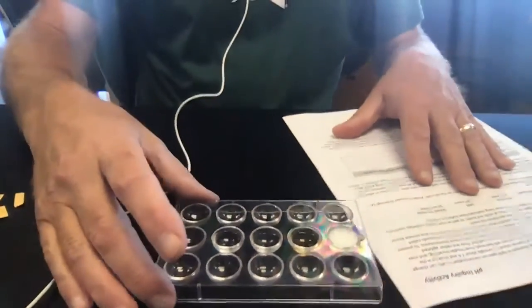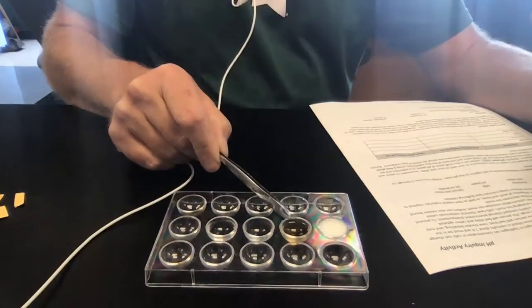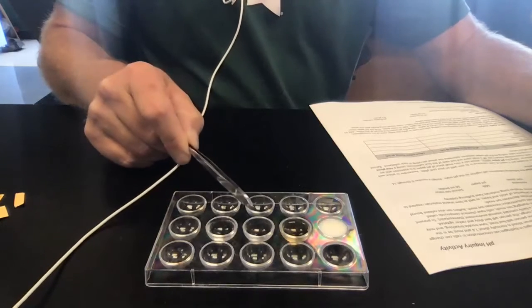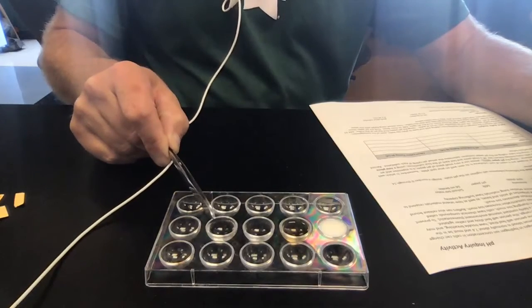Welcome back. So I'm going to move my screen down a little bit. So I have what's called a well plate. And in this well plate, I have 4 solutions. I have the milk, which is obvious in white. I have apple cider vinegar. I have bleach or ammonia, and I have plain water.